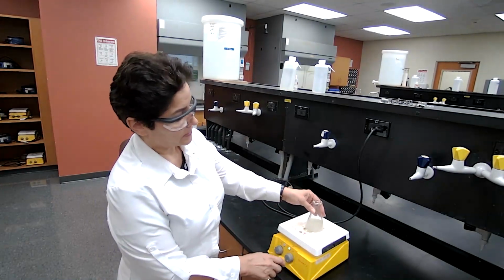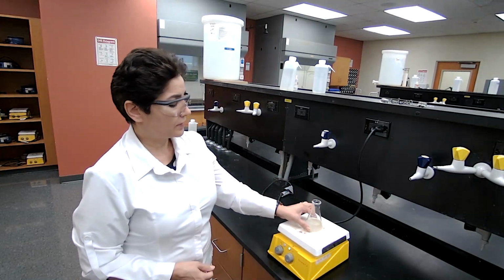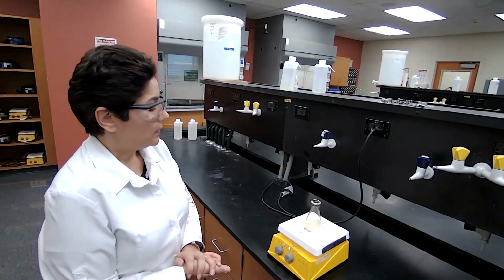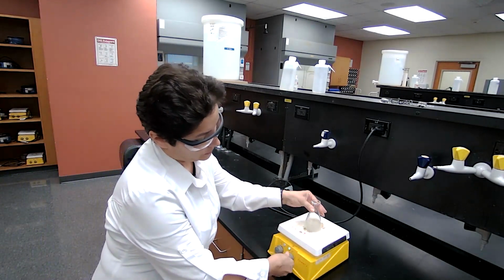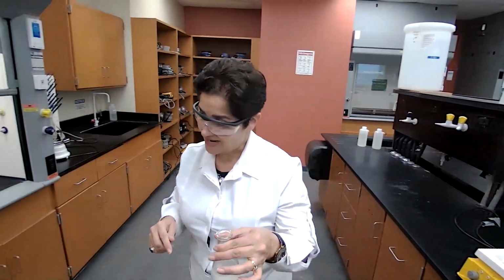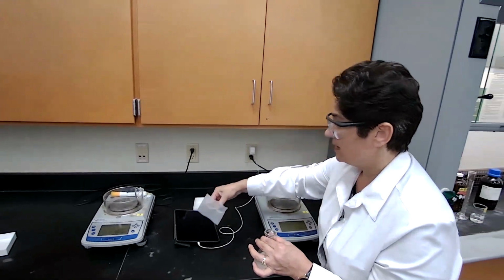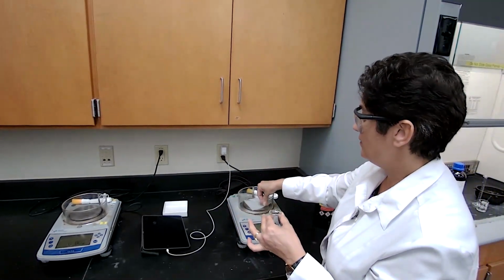Just gentle stirring is good enough. I hope that you could see the spinning of the magnet for 30 seconds to 1 minute. On the next step, we are going to measure the mass of acetone. For this reaction, acetone is the limiting reactant, and because it's the limiting reactant, we are going to measure the mass carefully, and we record the exact mass of the acetone.